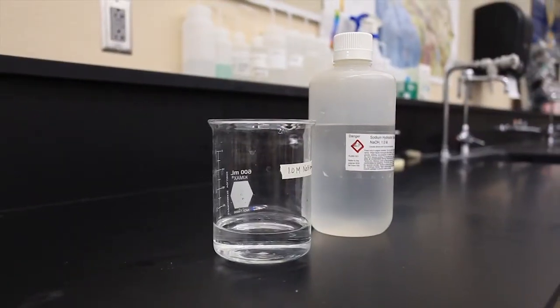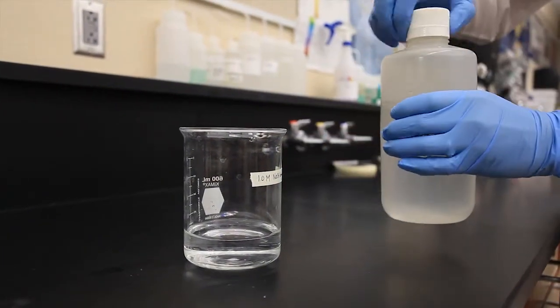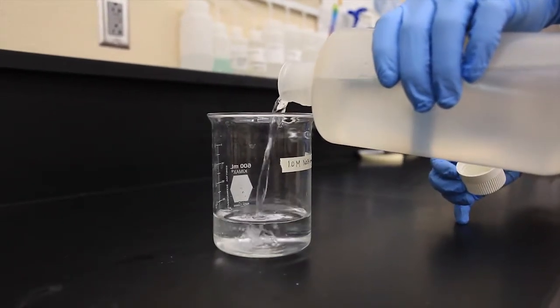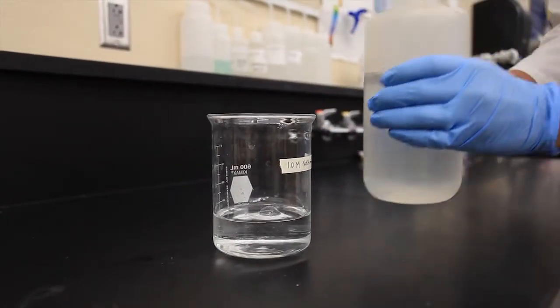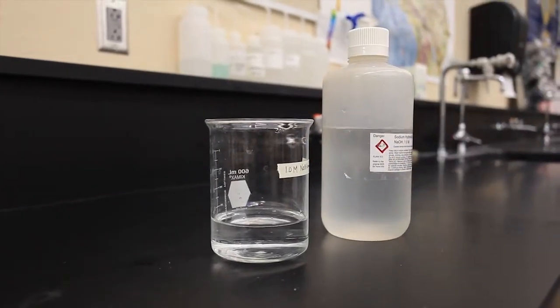A quick tip on handling chemicals is to never assume the lid or cap is secure. Pick up the bottle each time with the label facing the palm of your hand. This way you can ensure a firm grip and that any chemical drippings occur on the opposite side of the hand. Unfortunately, sometimes when chemicals are spilled, they don't just end up on the table or floor, they end up on us.